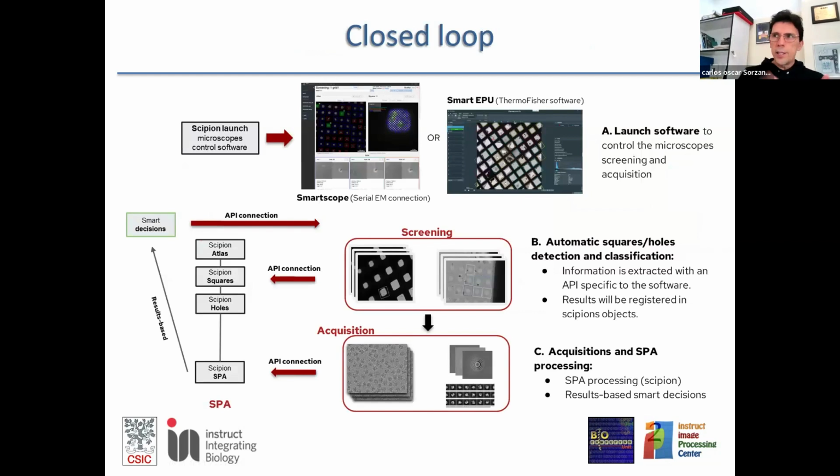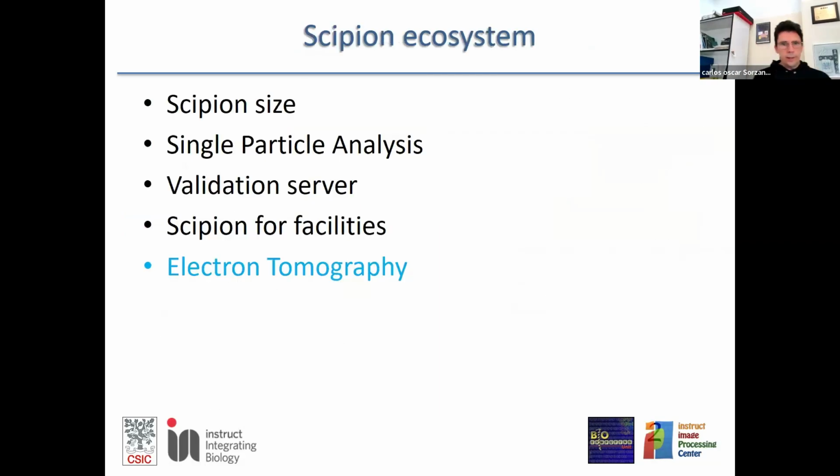So not only analyzing what the microscope is producing, but because we know which are the best quality images, we now can drive the microscope towards those areas that seem to be more promising to have high quality images.